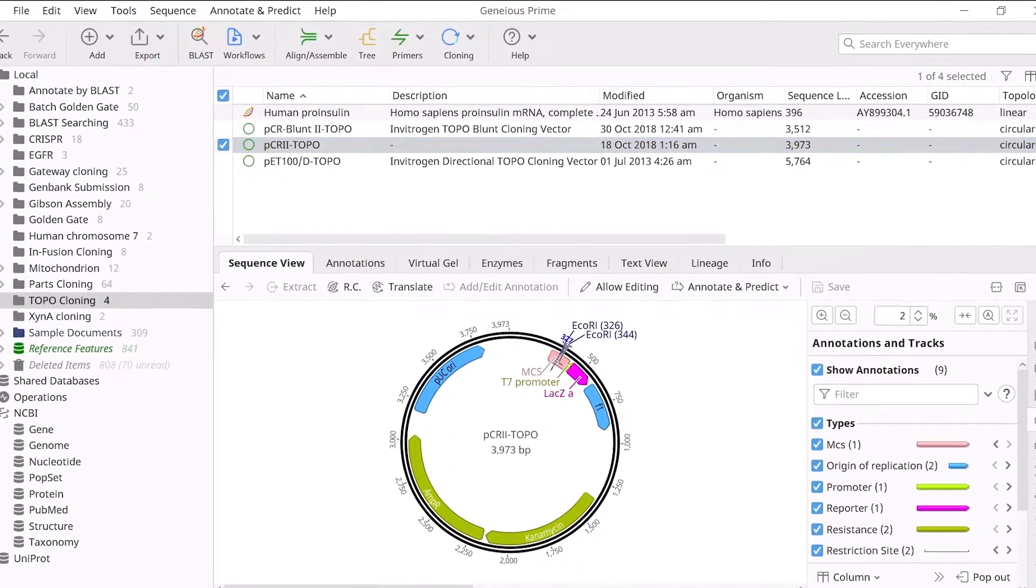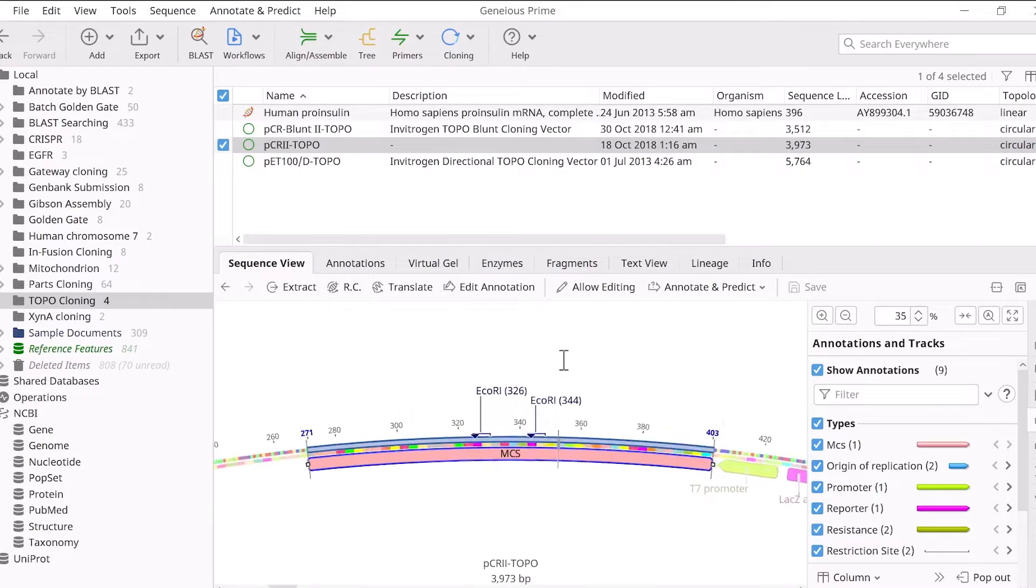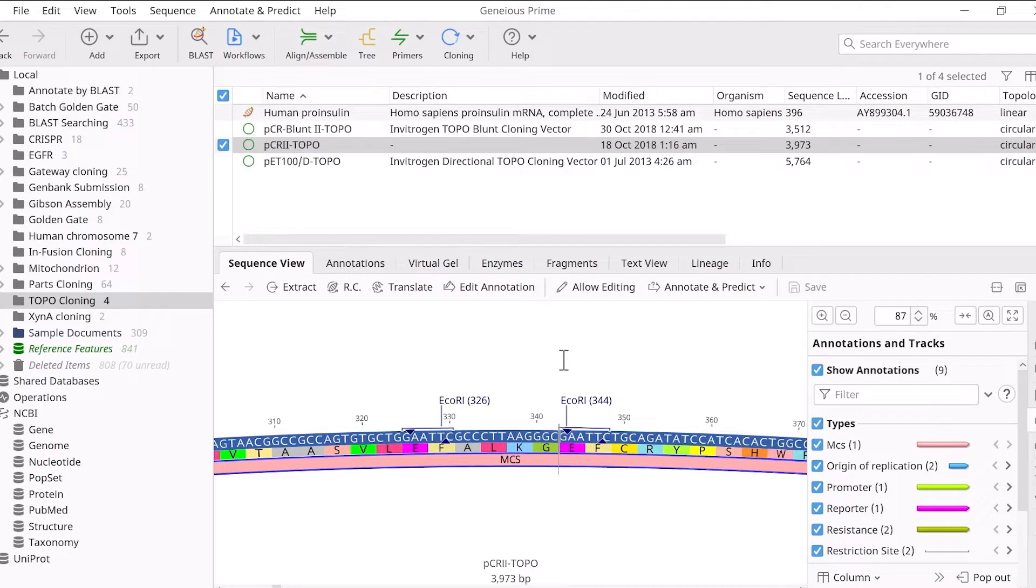Topo TA cloning requires a TA cloning vector containing a topo site. Genius will automatically detect this topo site during the simulation.